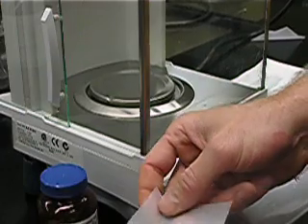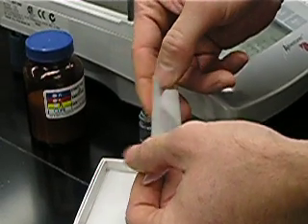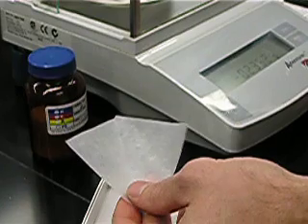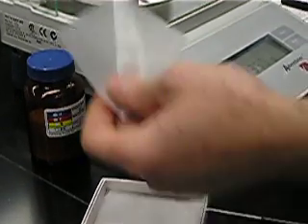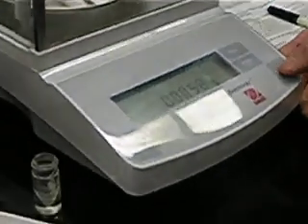First, we need to crease the paper. This will allow us to more easily transfer the solid to the conical vial. Then we need to tear the weigh paper. We'll put this on the analytical balance, let it come to rest, and then hit tare. This will allow us to weigh out the solid without having to consider the weight of the paper.